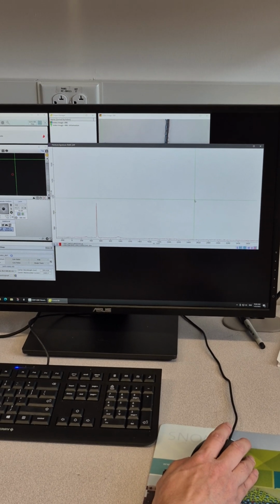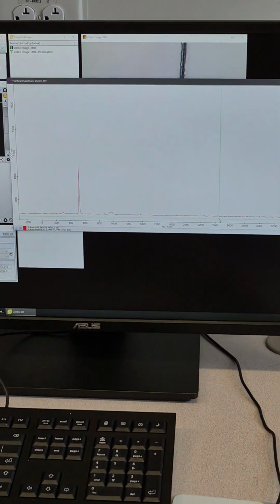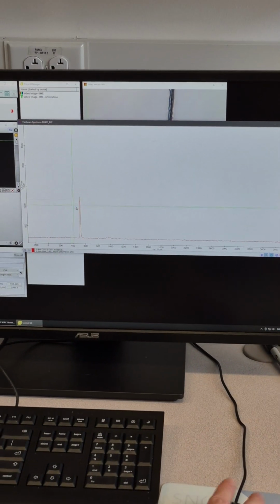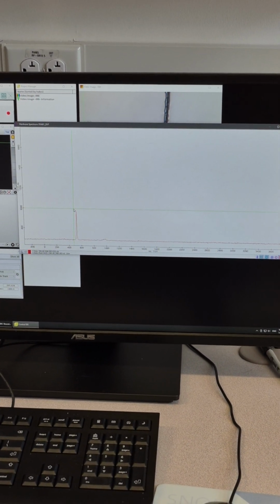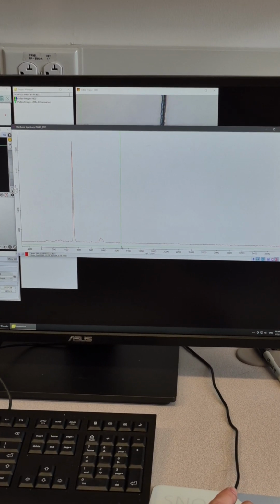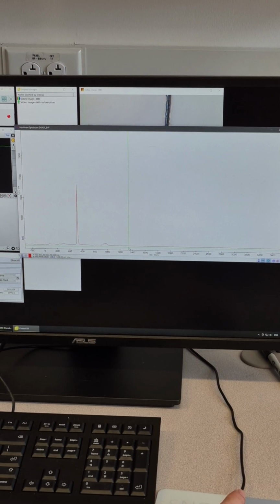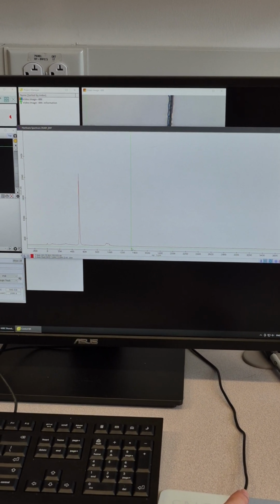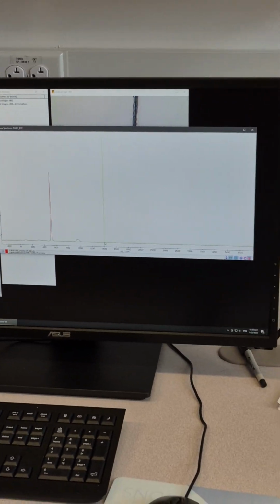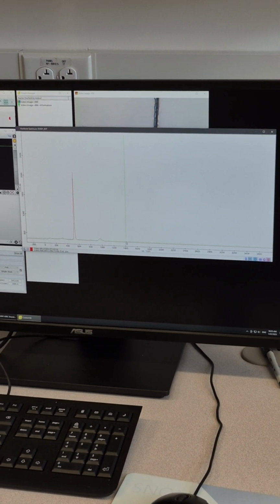You show the bottom line and put it a little bit lower, and then you scale it up and down and make the peak about half of this place, and then you can do the up and down to better scale. So it goes up and it's still going up, so I just scale down and it goes up and up. And if you go over, it will start to drop. So the same thing, you go up and down, and keep the maximized signal.